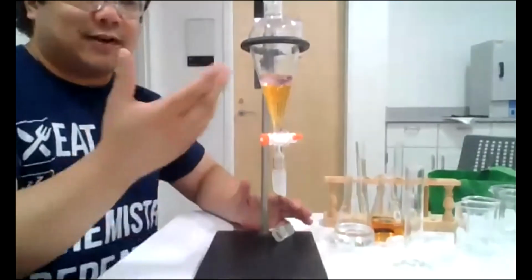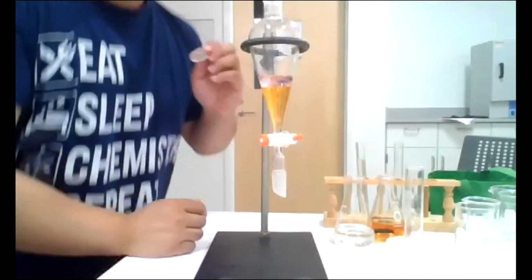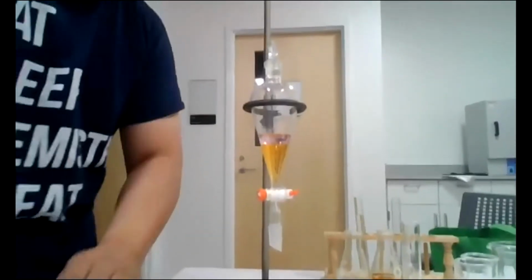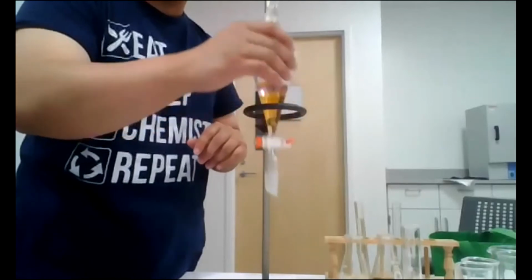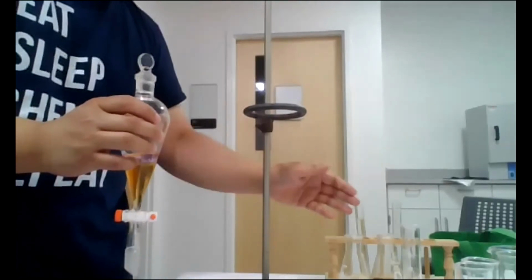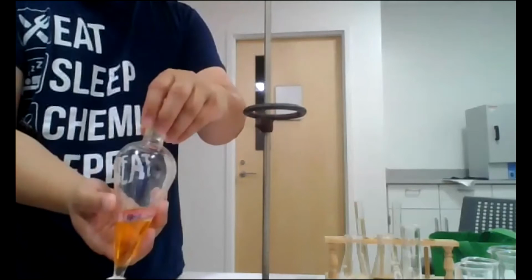Well, it's definitely less, right? This is only 10. Last time we used 20. And the idea here is we're going to do this in parts. So it is more labor intensive. It uses the same amount of material ultimately, but it's more labor intensive. Is that labor going to be worth it in terms of separating out the iodine, in terms of washing the aqueous layer? And so again, what's the technique?